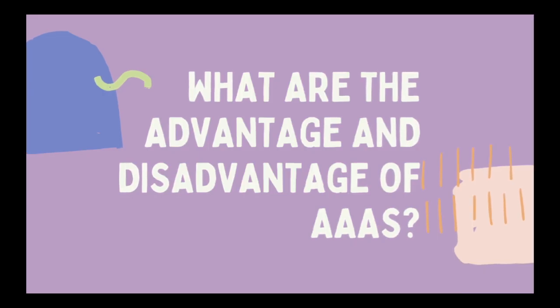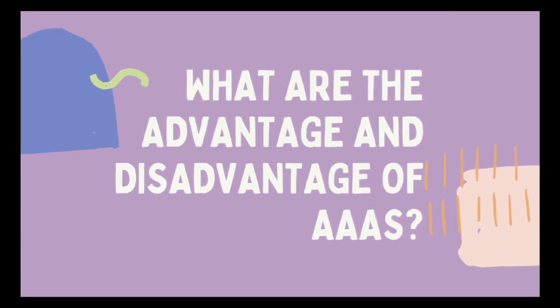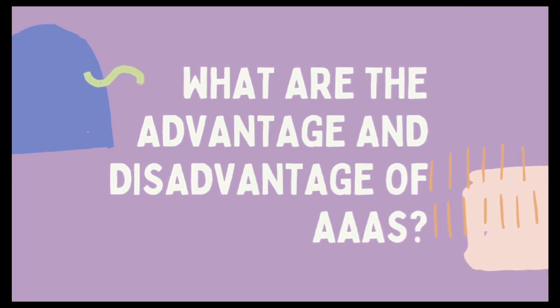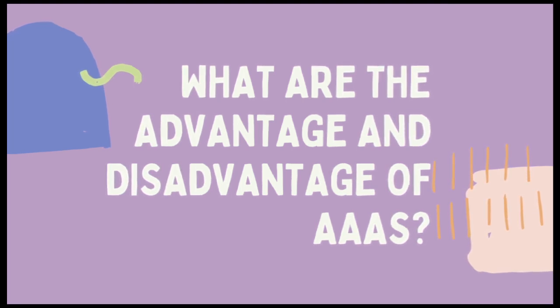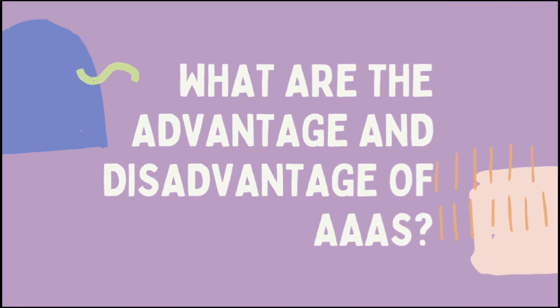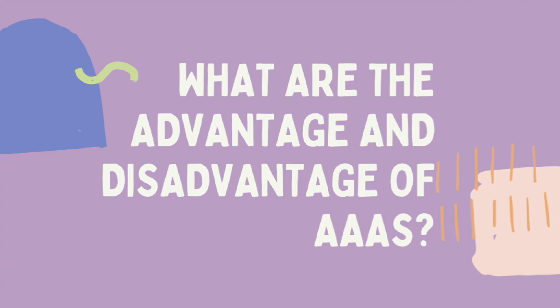So what are the advantages and disadvantages of AAS? The advantages of AAS, based on experimental work, include a high degree of sensitivity and freedom from interference from other metals present, while the disadvantages are: only solutions can be analyzed, less sensitivity compared to graphite furnace, relatively large sample quantities are required, 1 to 3 ml, and problems with refractory elements.